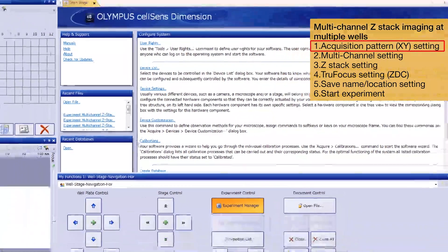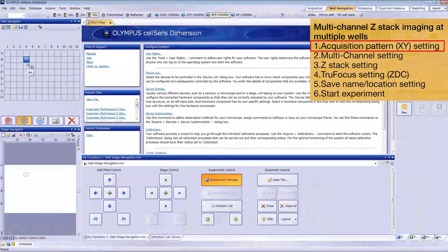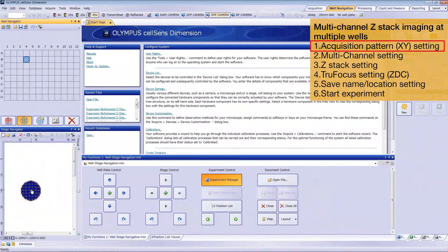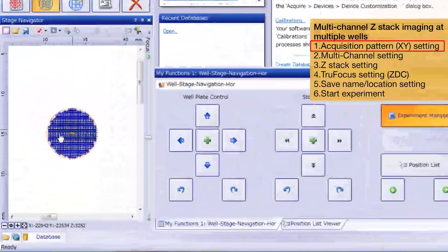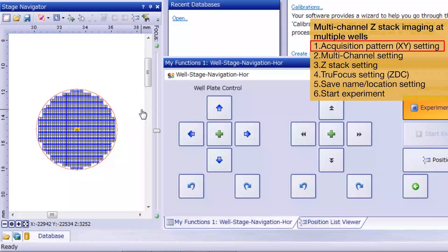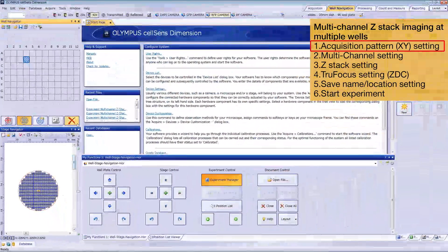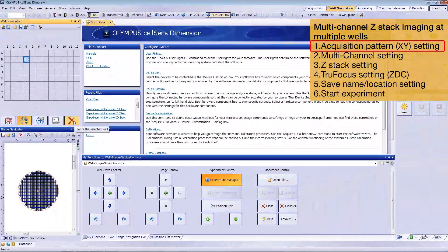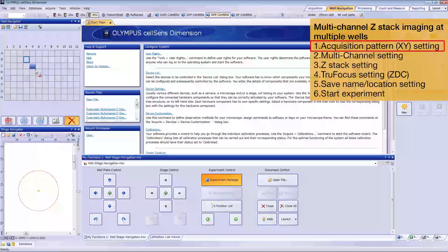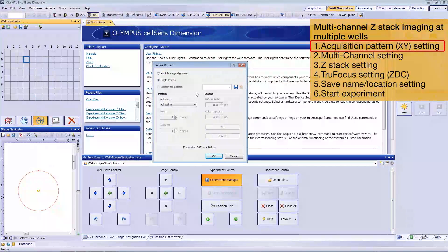Click a well to assign the pattern to it. The whole area inside the well is registered as an acquisition area. If you want to delete the pattern, click the Delete button and then click on the well. The pattern will disappear. For more information about other patterns, use our online help tool.